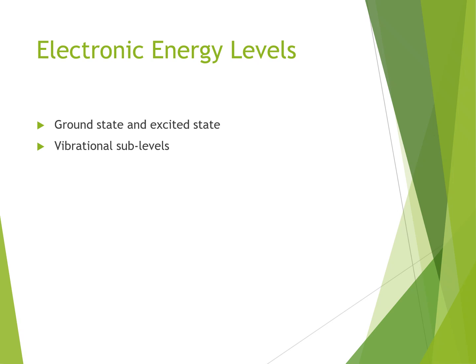As we already discussed, when molecules are in the excited state they lose some energy as heat during vibrational relaxation, and when they come back they have lower energy and so longer wavelengths compared to the absorbed photon, which has higher energy and shorter wavelength.